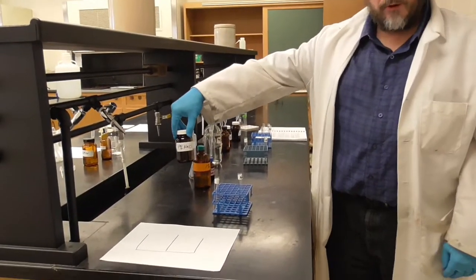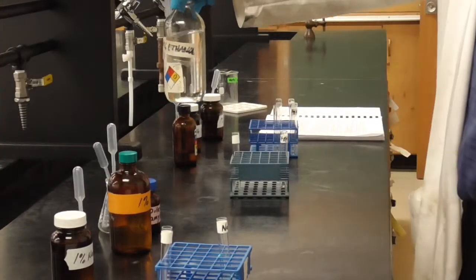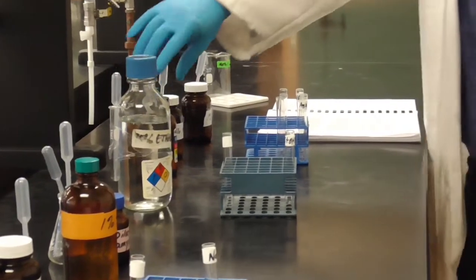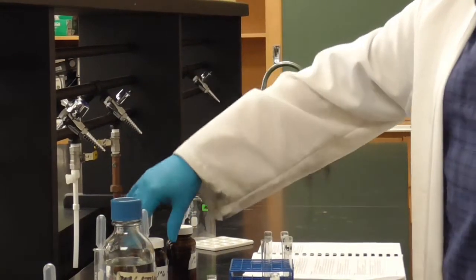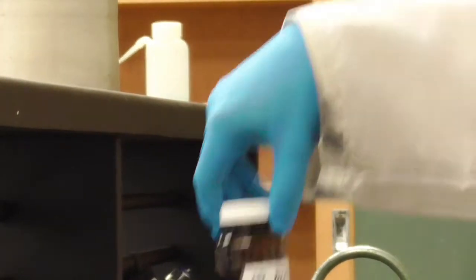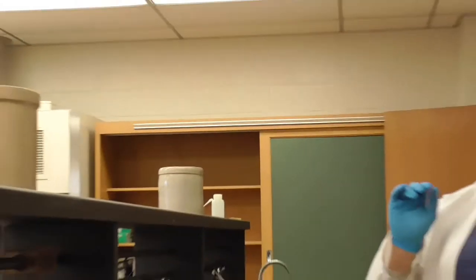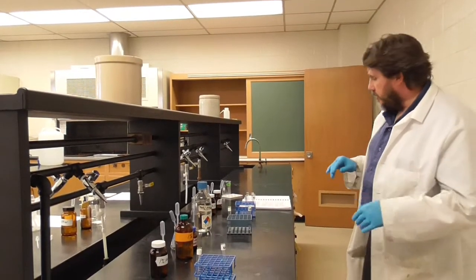We have sodium chloride, so normal table salt. We have ethanol, which is the alcohol in beer and wine and such. And then we have some heavy metals. We have silver nitrate, so that's going to put silver in the solution. We have mercury chloride, and so mercury, the heavy metal. And we have lead nitrate, and so mercury, lead, and silver. See, many times heavy metals such as those will serve as inhibitors to enzymes, so let's find out.